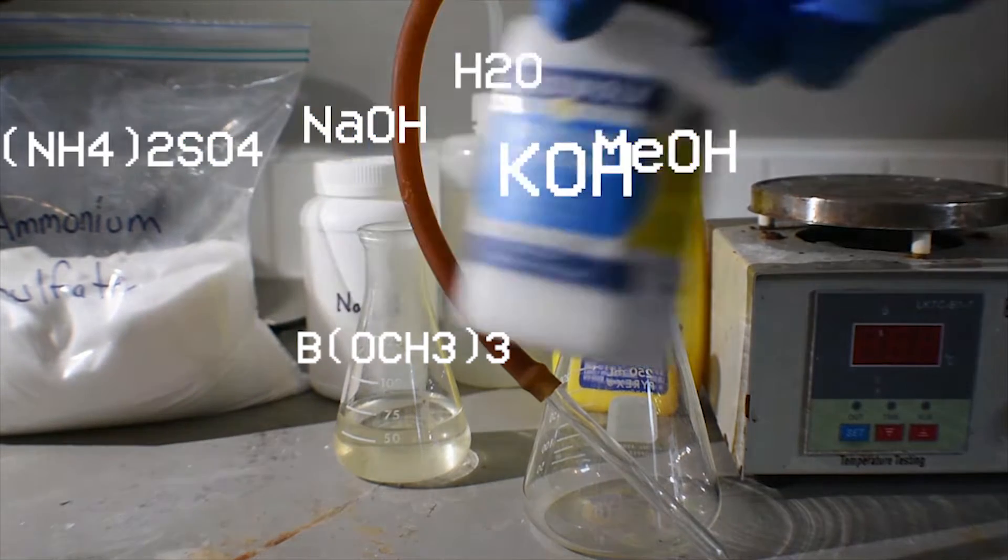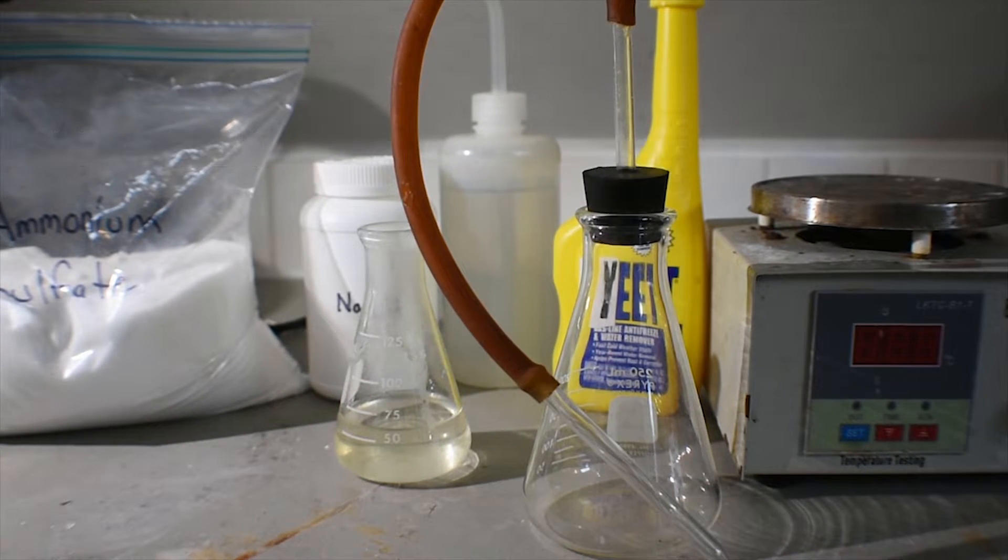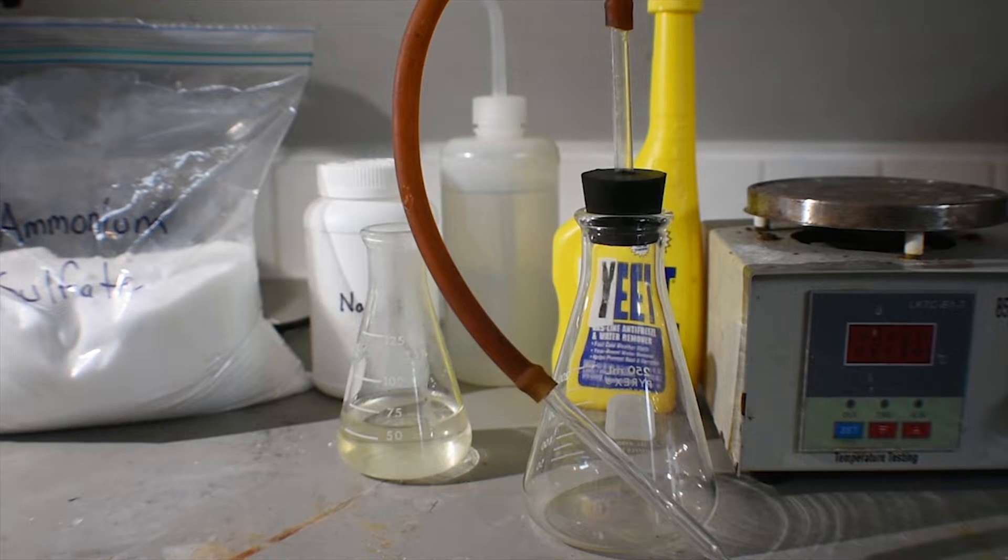We're going to generate ammonia via the reaction of sodium hydroxide, or really any hydroxide like even potassium. The ammonia generated will be led through the trimethylborate, and that will form the ammonia trimethylborate addition compound through a fairly exothermic reaction. I tried this last night and it was actually fairly warm to the touch — almost a little too hot to hold.